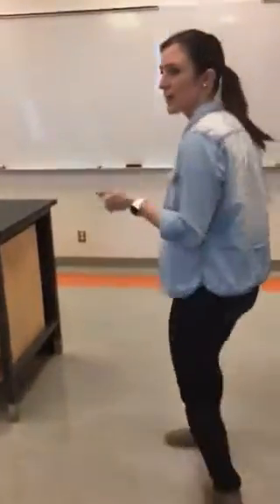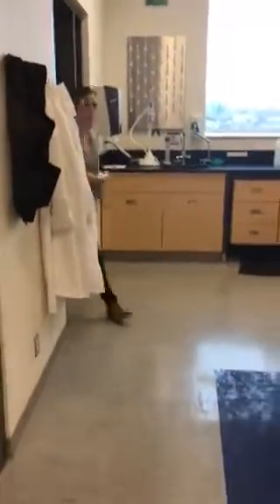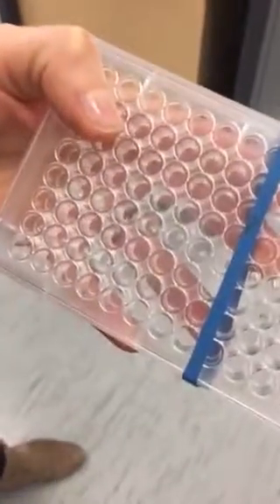So now the samples are weighed. You should grab one of the EA trays. So the samples get weighed. You can just zoom in here. So you can see all of the little samples folded up in those tin capsules, and of course we have our sheet that keeps us all organized. And then they get brought into the CO2 room.